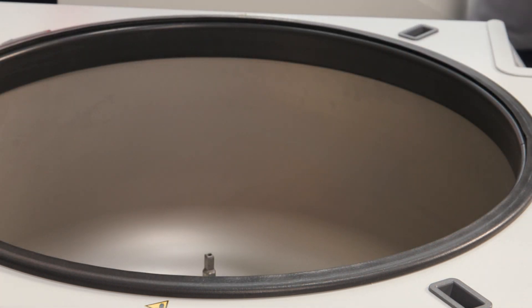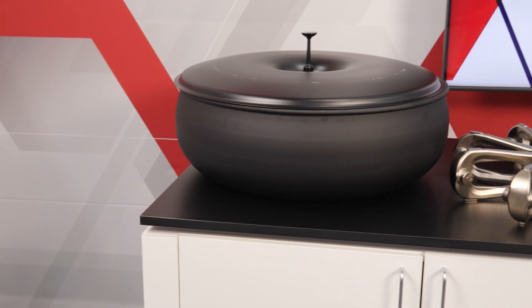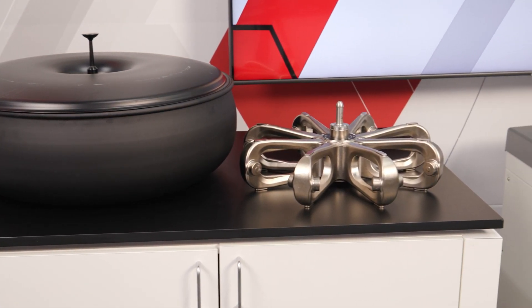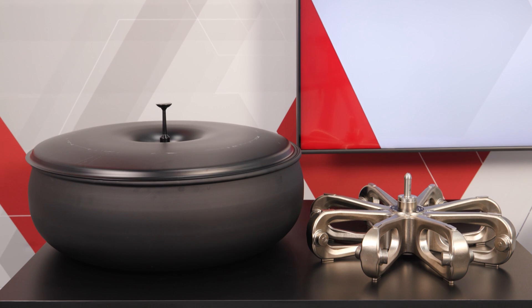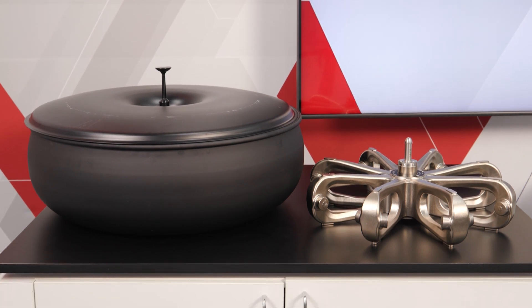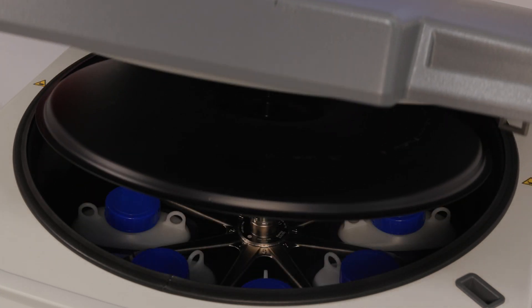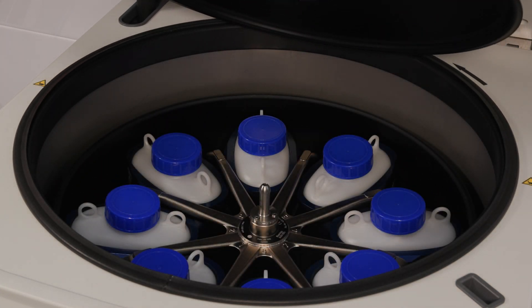Lift the windshield bowl straight up from the drive shaft. It may be easier to handle some windshield bowls with two people. To avoid damaging or deforming the windshield, never put down the rotor windshield assembly on its side. That concludes this proper usage video for windshield rotors.